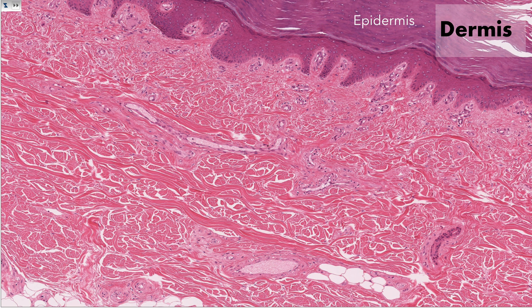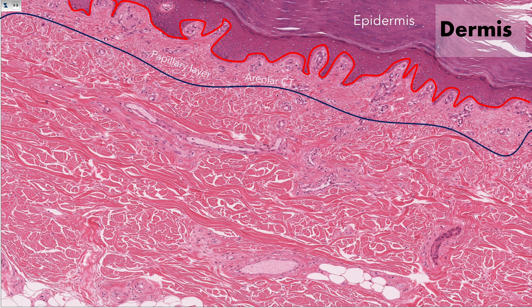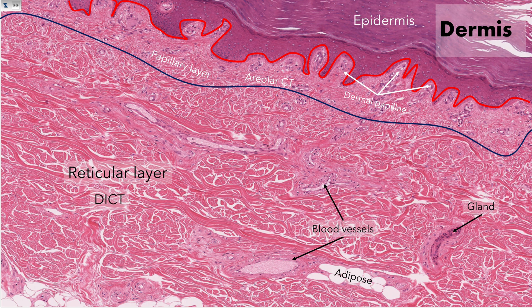The dermis is a much thicker layer located under the epidermis. This line is the stratum basale of the epidermis. The dermis is composed of two layers: the papillary layer and the reticular layer. The papillary layer is composed primarily of areolar connective tissue, while the reticular layer is composed primarily of dense irregular connective tissue. Note that the name is a bit misleading in that it is not composed of reticular connective tissue. The reticular layer is where we find most of the structures of the dermis, like blood vessels, glands, nerves, and islands of adipose tissue.